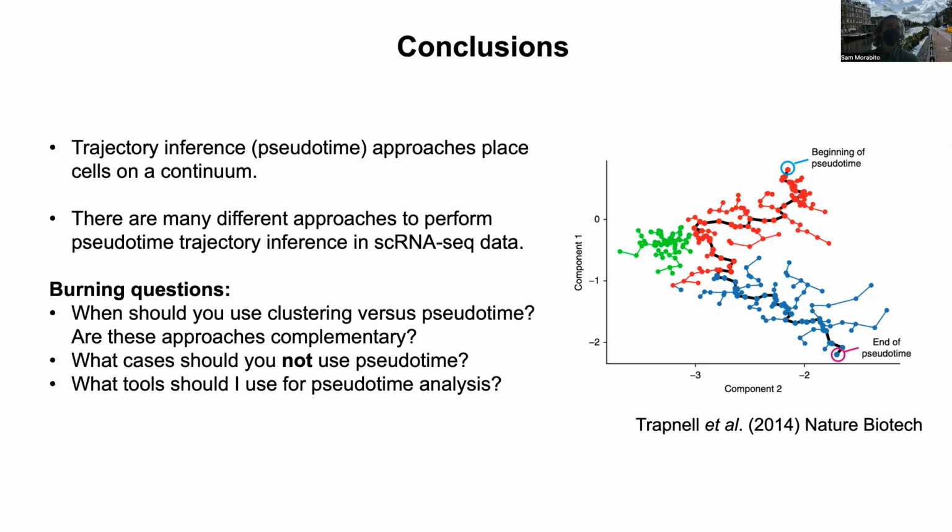It's basically causing a developmental cascade to occur, and we have some a priori knowledge about which time points should have cells at which different parts of the cascade. So we subsetted our data and then did pseudotime using just those time points.